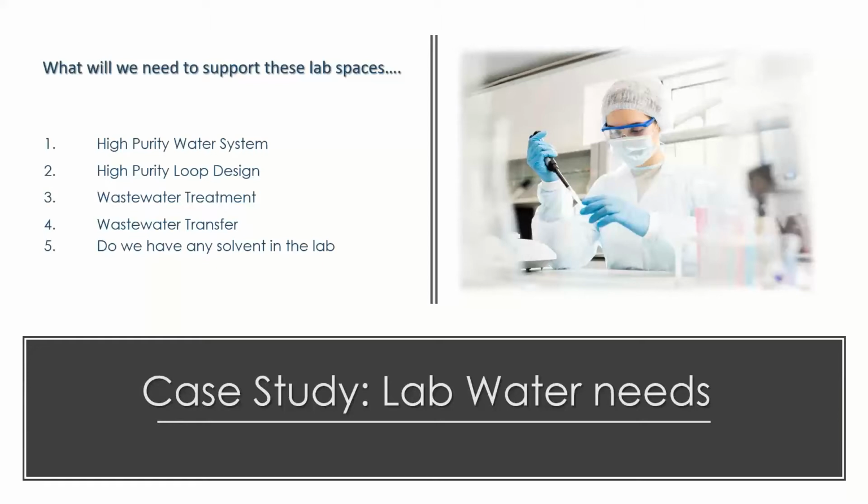And while we're not going to specifically talk about solvents today, it is worth noting that they are handled a little bit differently. Solvents obviously need to be collected for use and then destruction off-site. We do have a webinar on our website for those who are interested in learning a little bit more about solvents. Today we're going to predominantly focus on high purity water and pH and how those two are tied together as part of an overall lab-based design.